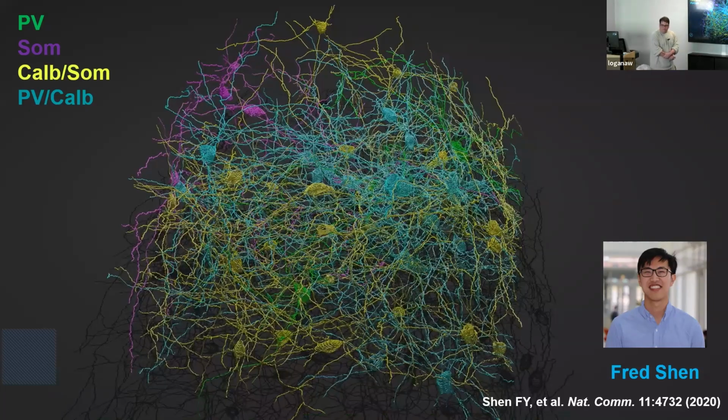Just a quick question. Are these images that you are showing us coming from one image from a slide that may have different colors to it because it's looking at different pathways, or are these stitched together images from multiple slides?